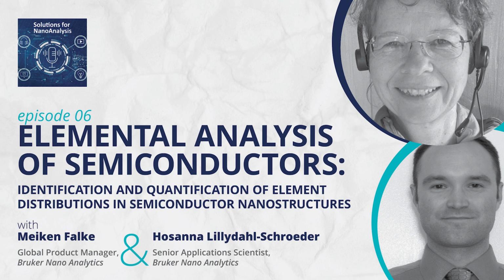Yeah, so that was about nitrogen and related overlaps. And now you also asked about doping of semiconductor materials with elements such as boron, phosphorus, arsenic, and there are more, I think. All of these elements can be identified and quantified by EDS. To which level or minimum mass fraction, to use the right term, depends on the combination of microscope and EDS technology. The better the microscope, the better the outcome for EDS, and also the better the EDS technology, of course, the better the result will be. If we have a combination of a high-end microscope with a high-end EDS detector, that would of course yield even better EDS results.